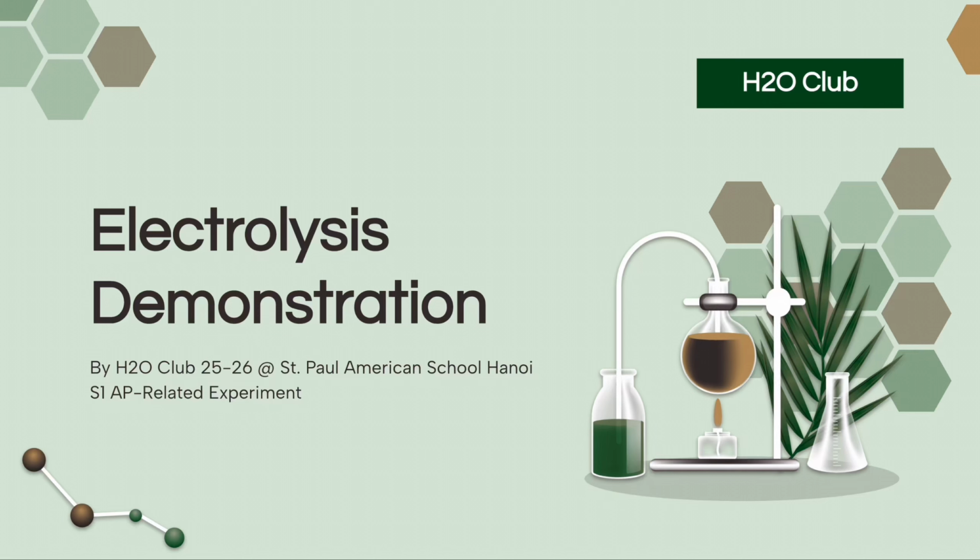In this video, we'll prepare for our AP Chemistry related experiment for Semester 1 on electrolysis. By the end of this video, you'll understand the key background concepts and know what to do for the experiment.